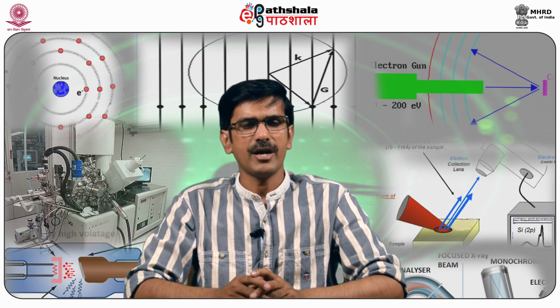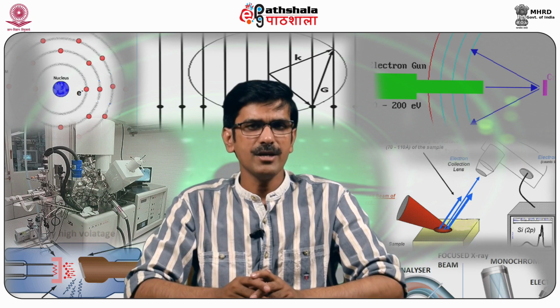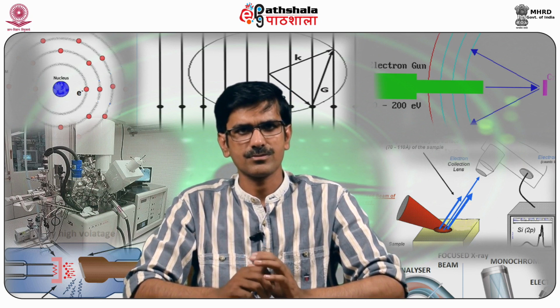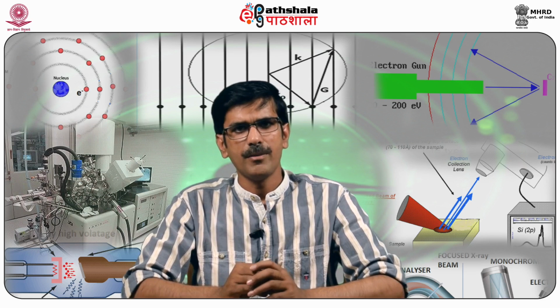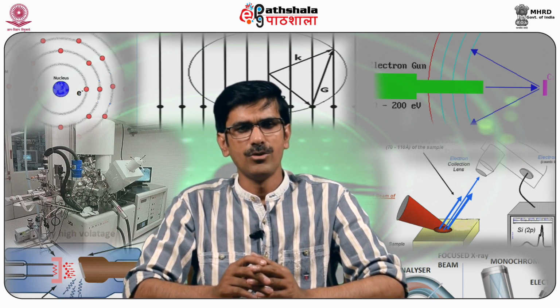Rather, they are added to the energy histogram as one single count, making the resultant peak distorted. Therefore, in order to avoid piling up of the peaks, it is advised to keep the dead time below 30%.